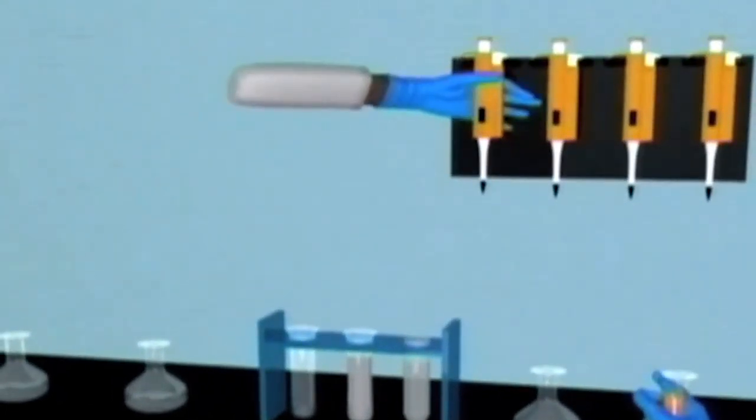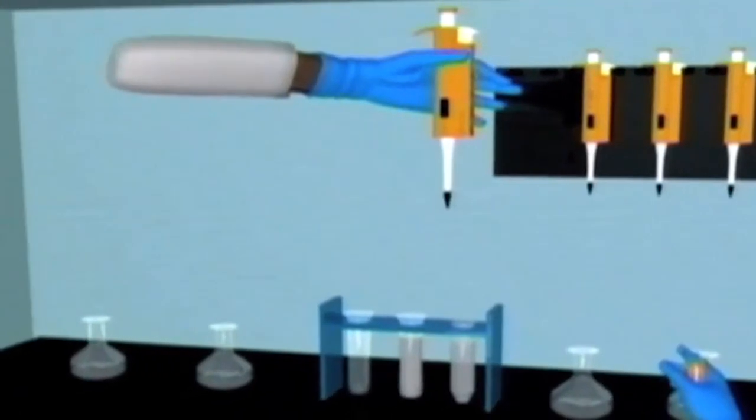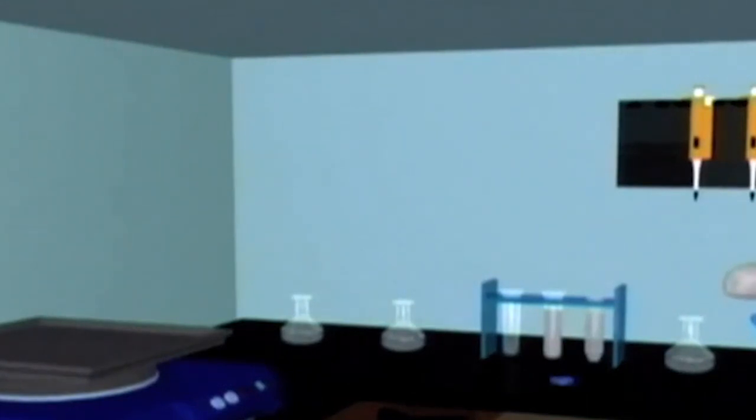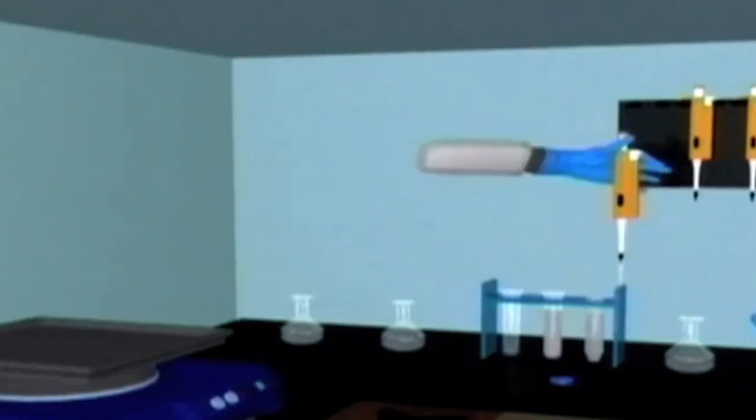After removing the chips from the minus 80 freezer or synthesizing the proteins by using a cell-free expression based system, first of all, you would like to block those areas which do not have the spot features. So, to avoid non-specific binding, first of all, one needs to add a blocking solution. Blocking can be performed by using milk, BSA, or super block, and scientists also prefer a cocktail of different reagents for the blocking solution.